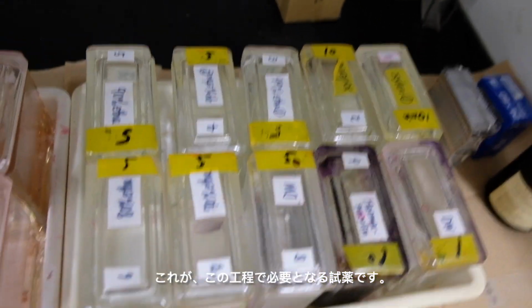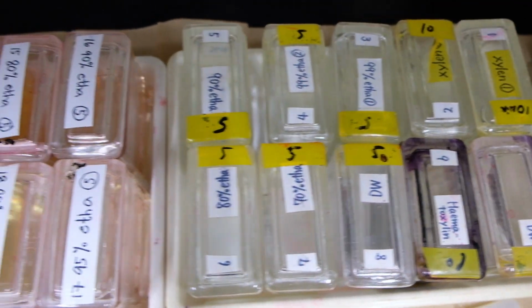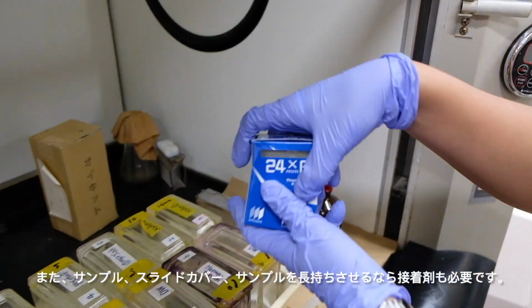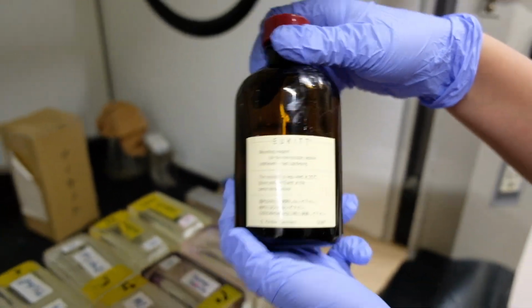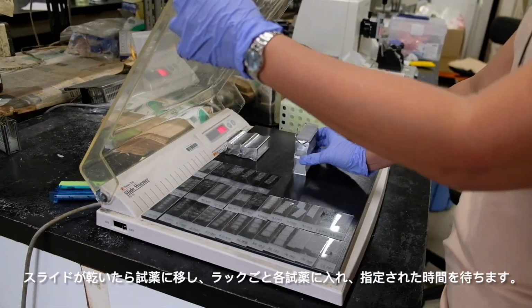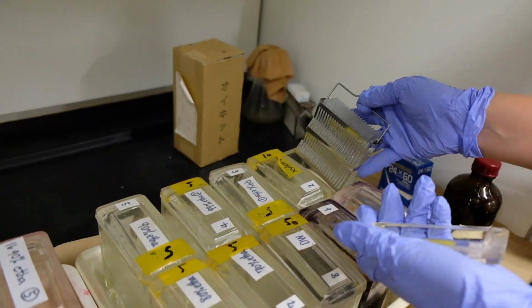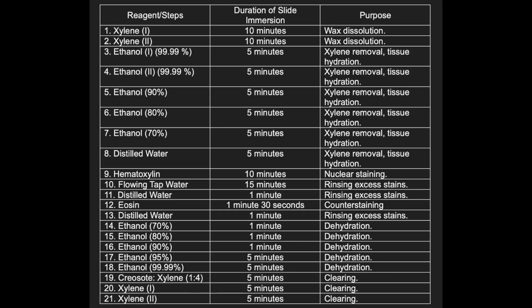These are all of the reagents that we are going to need for this process. In addition to the reagents, we'll need our samples, slide covers, and the mounting reagent, which is optional but can help preserve your samples longer, and the dropper to put the mounting reagent on. So once the slides are dry, we can take them over to the reagents, and you'll put the entire thing into each reagent for a specified time. The order of how to stain is quite long, and so we'll put a table here with detailed instructions on which reagent for how long, so please pause the video to look at them.